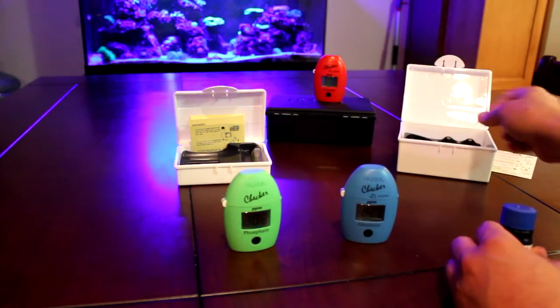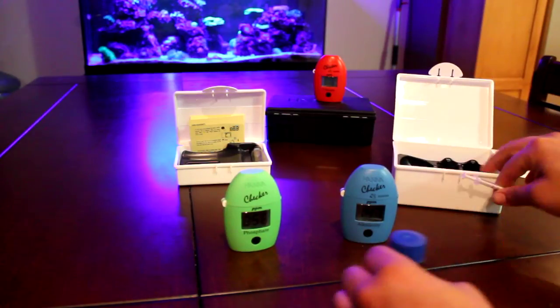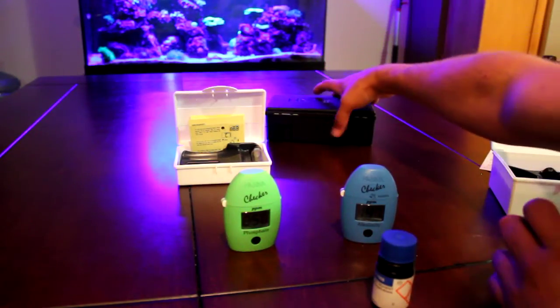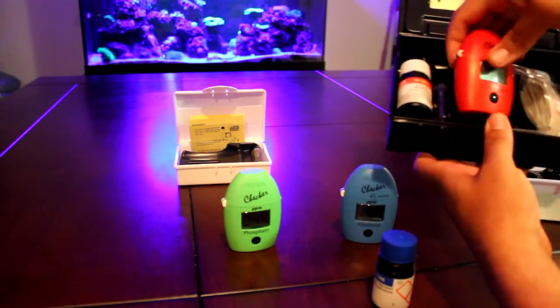The alkalinity actually came in the huge box and the calcium was jammed into the smaller one, but I just traded them. Definitely need extra space for the calcium kit - it's got a lot going on there.